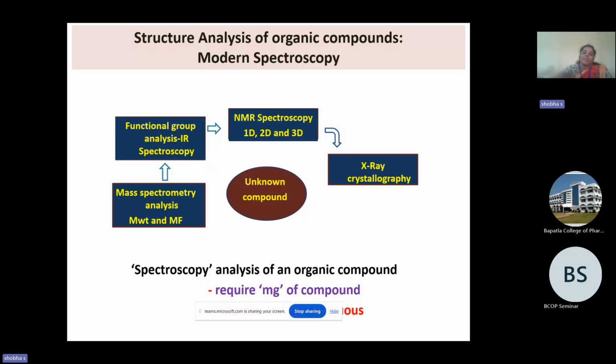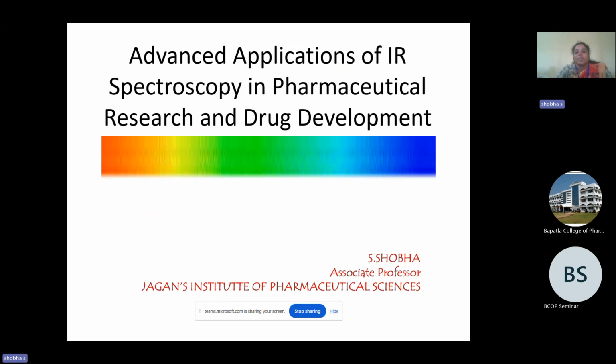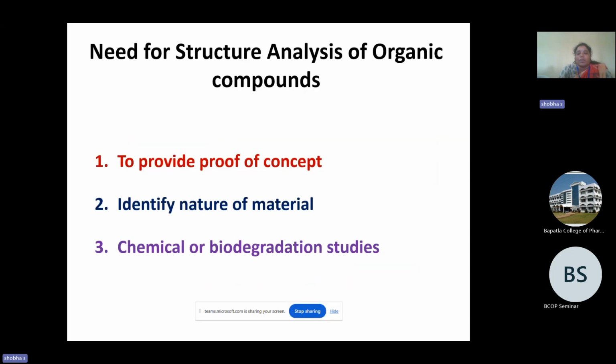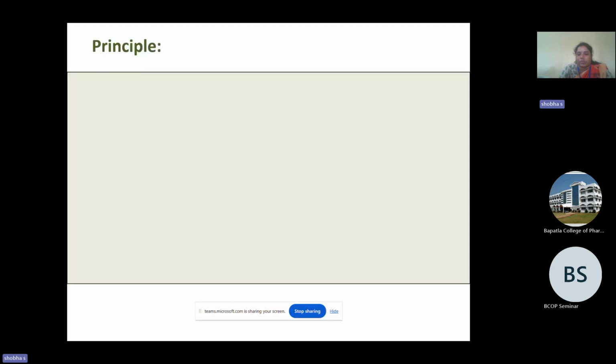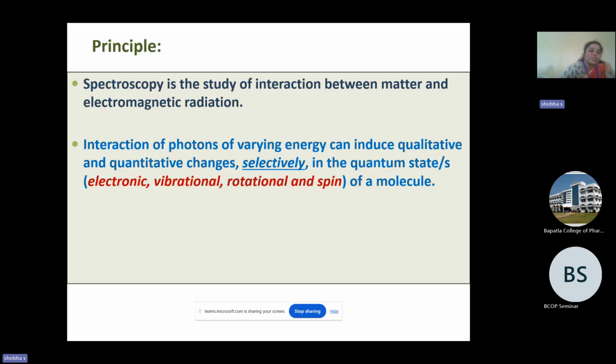So mainly here, for the analysis of spectroscopic techniques, by seeing the first slide itself, I have included the electromagnetic radiation, how it will interact with the matter. Matter means any compound; they may have protons, they may have electrons, and that is the only thing which will lead the show. So coming to the IR, the infrared spectrum, we are going to see the bond vibrations, how the molecules are connected with each other. They maintain some vibrations. Those only will be represented in IR spectroscopy.